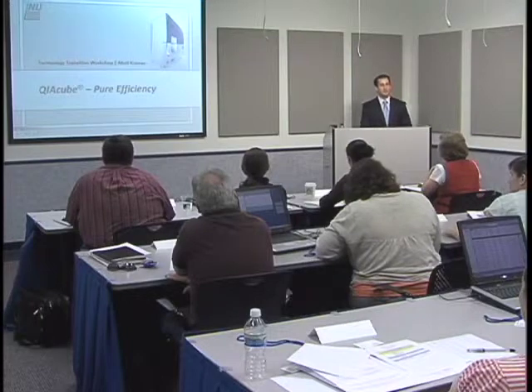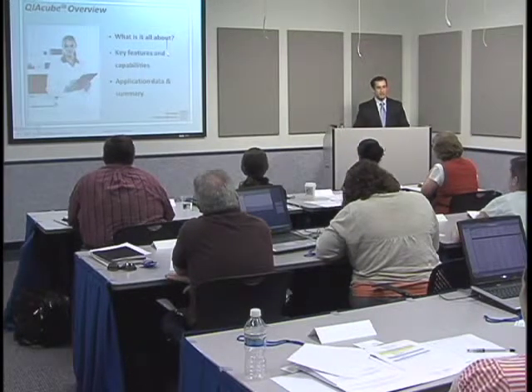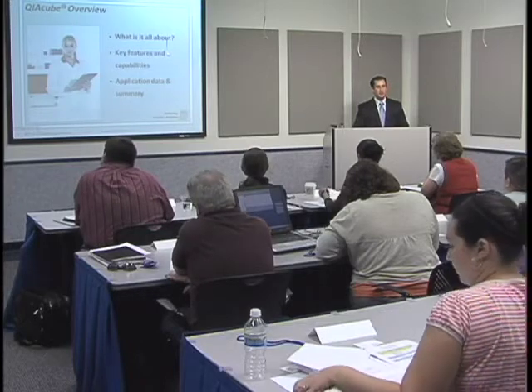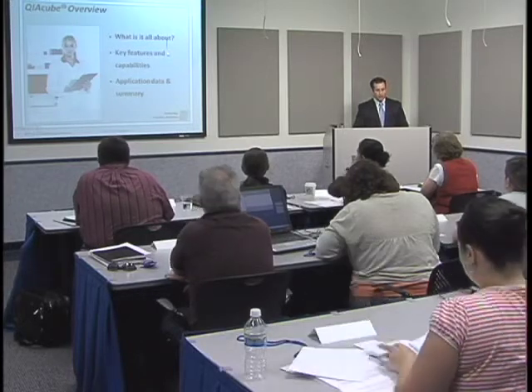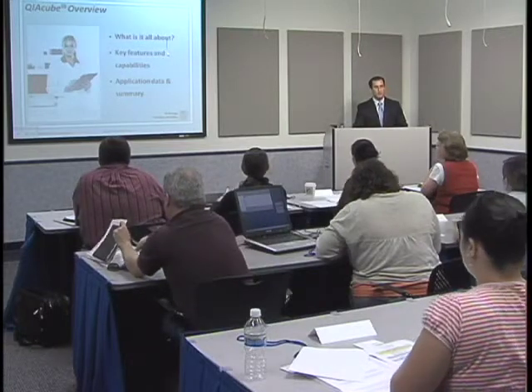So I'm going to discuss the QIAcube. I'm going to let you know what it's all about, discuss some of the key features, some of our internal validation data, as well as some application data, and give you a summary on the system, as well as some maintenance recommendations for the instrument. So what is the QIAcube all about?